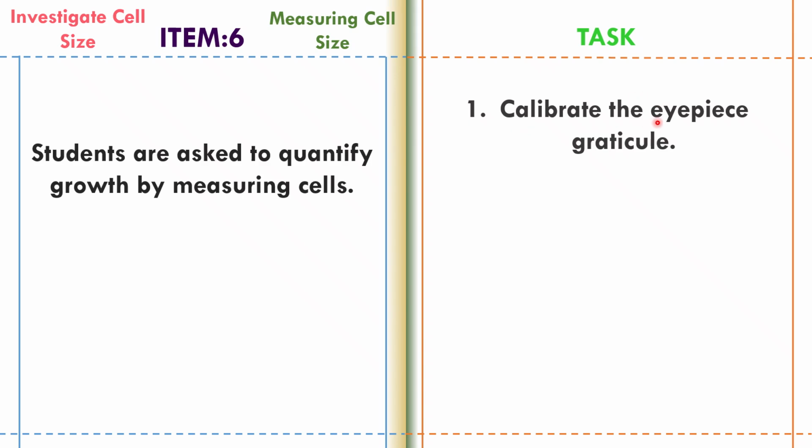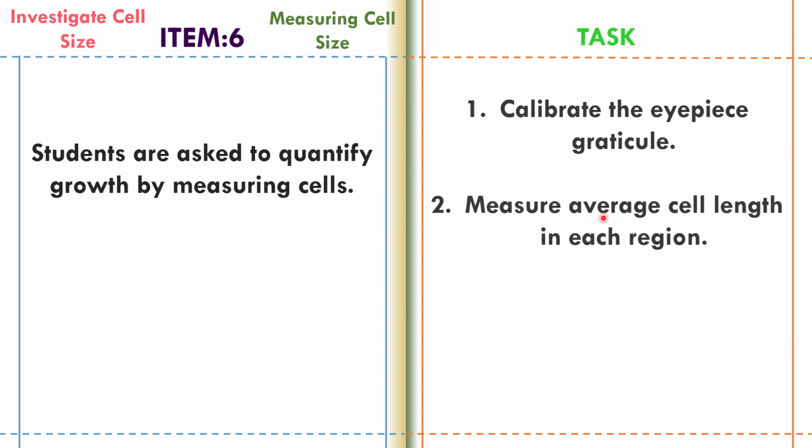Calibrate the eyepiece graticule. Measure average cell length in each region. Compare results.